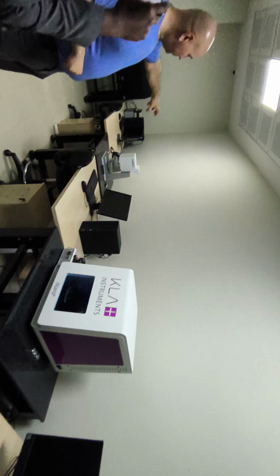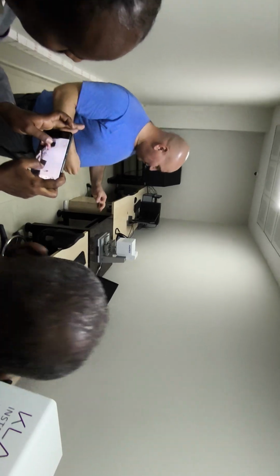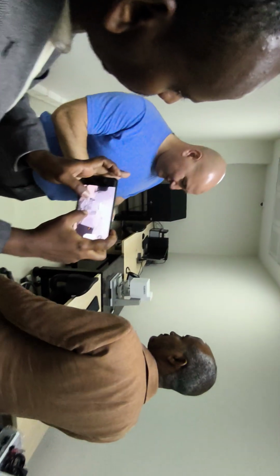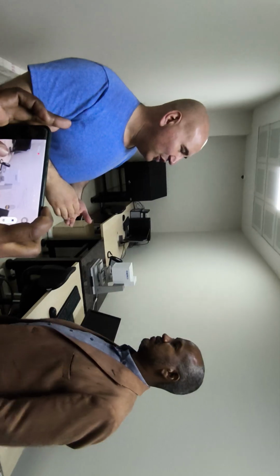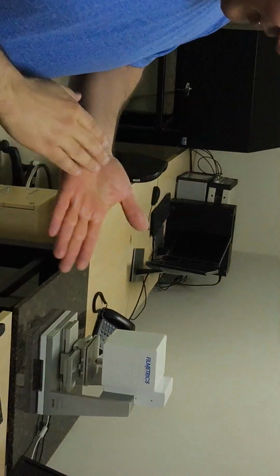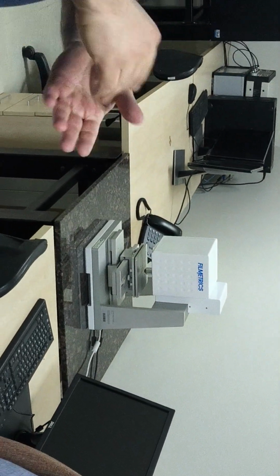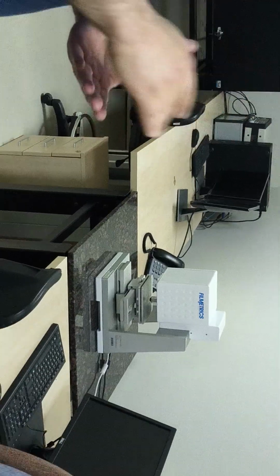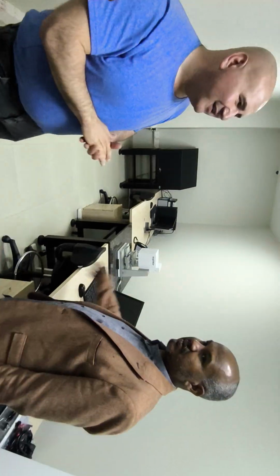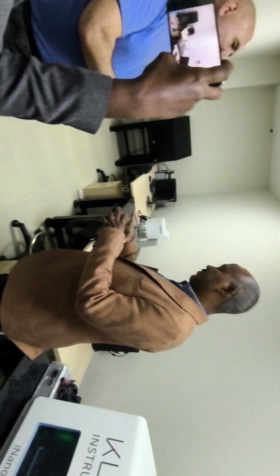This one is for optical surface morphology. We use it, for example, with a coin: when you cut something, it looks very shiny and you say it's homogeneous, but when you put it here, you see that it's not homogeneous. There are some peaks and valleys and so on.